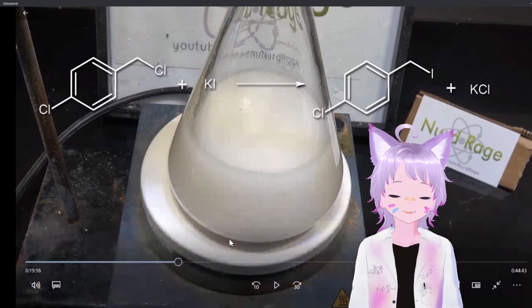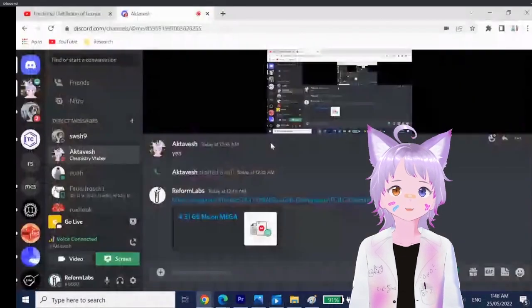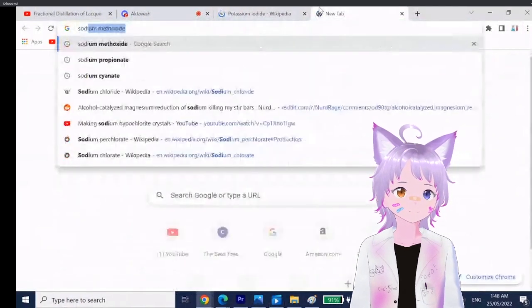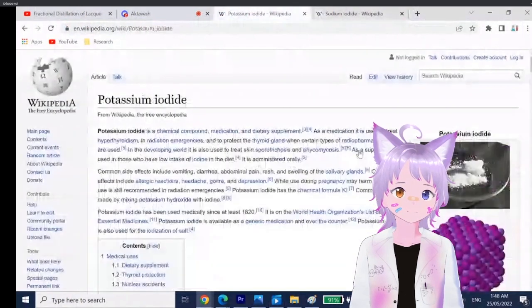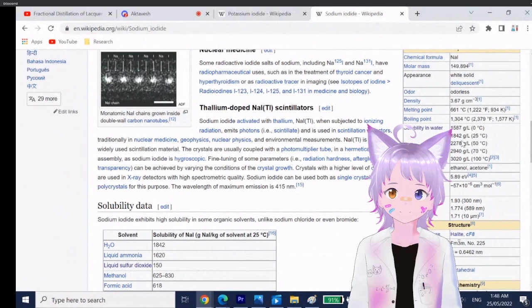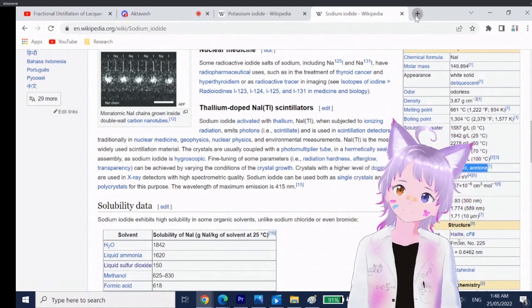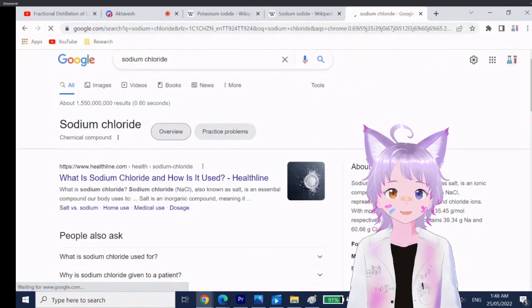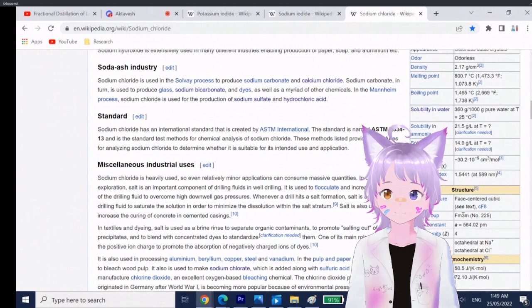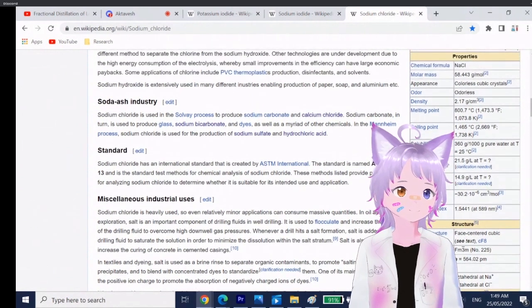Does it strictly have to be acetone? I know that definitely we can use anhydrous ethanol. You know why? Because it's even less soluble in anhydrous ethanol. I don't think you're gonna find it. Sodium iodide. And yeah, we just use ethanol. Screw using acetone. Sodium chloride is insoluble in ethanol. That's what I use to separate it from any other junk, right, after the UV step. Anyway, we could just use ethanol.